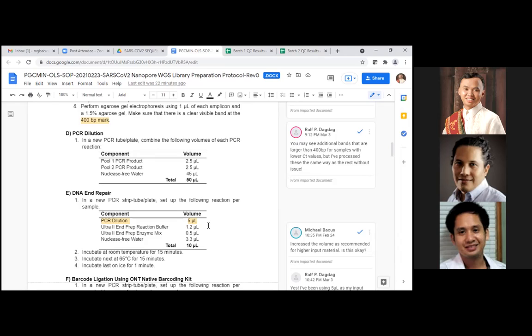Because the absorbance they are measuring is usually more of a blanket general absorbance level, but it does not fully represent the concentration of the RNA that's present. Because it can also measure other things that are double-stranded or single-stranded in the solution, which might not be your target genome. Okay.